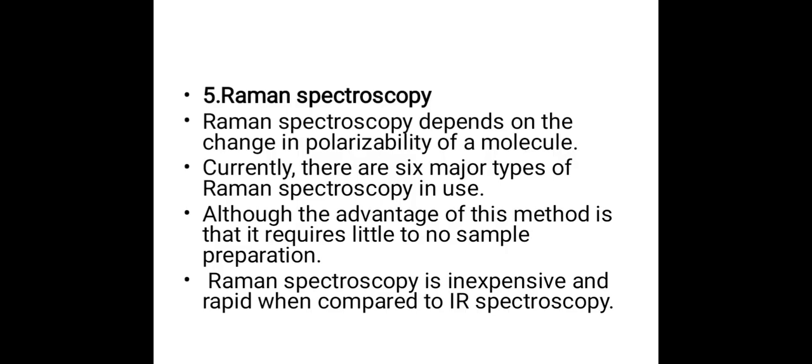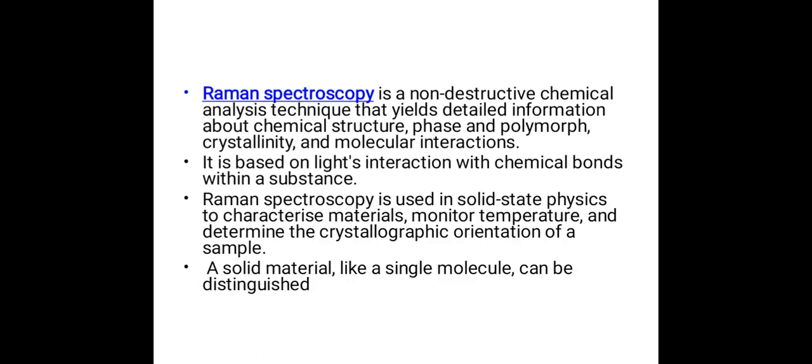Raman spectroscopy. Raman spectroscopy depends on the change in polarizability of a molecule. Currently, there are 6 major types of Raman spectroscopy in use. The advantage of this method is that it requires little or no sample preparation. Raman spectroscopy is inexpensive and rapid when compared to IR spectroscopy.